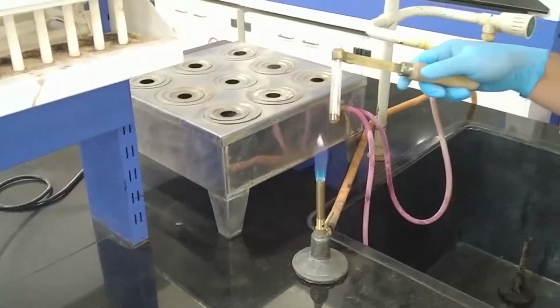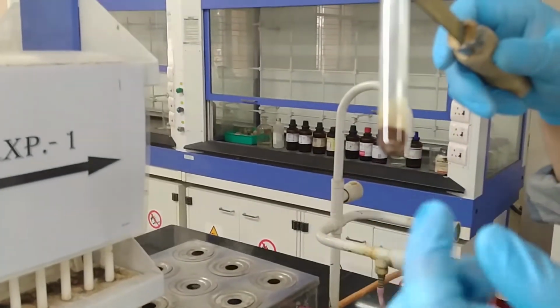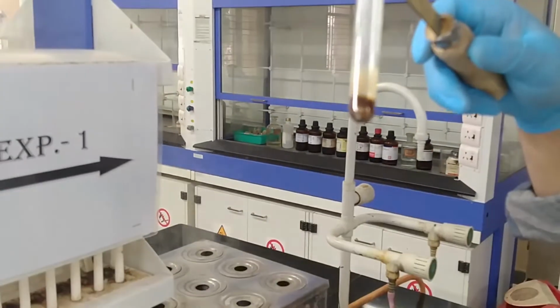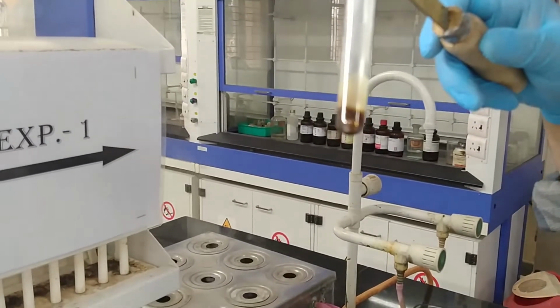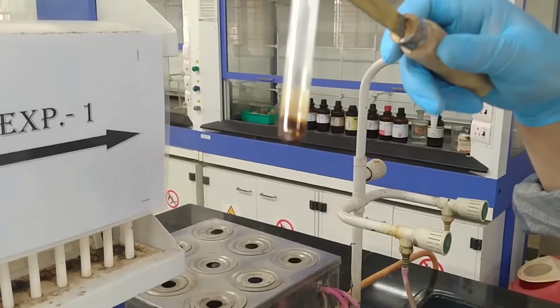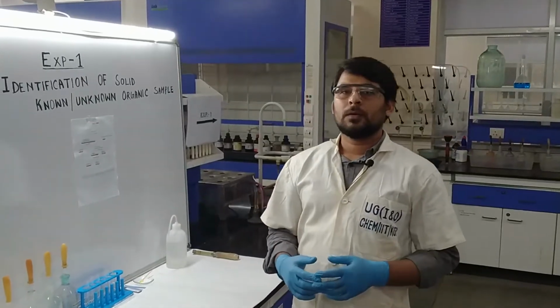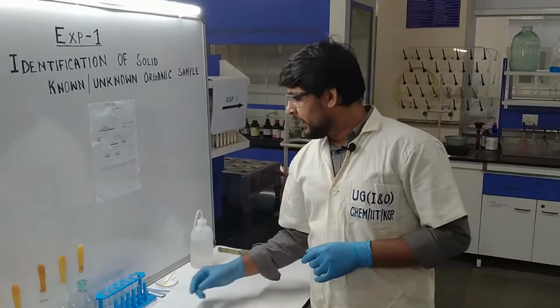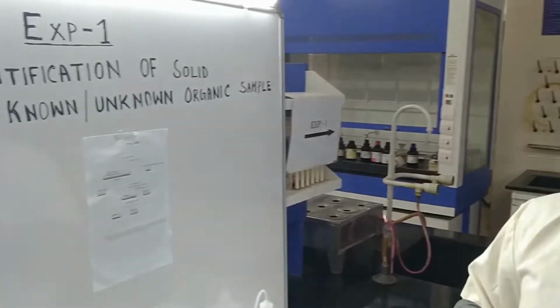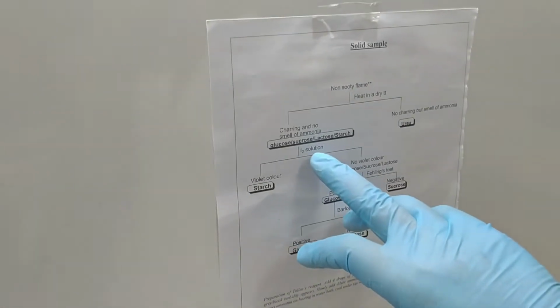So you can see it is already charred, and some brownish black thing appears inside the test tube. Okay, so that means dry test tube heating test for glucose is also positive. So that means this also completed. So after doing heat in a dry test tube, this we get positive. So according to the flow chart, coming test is what? Test with the I2 solution.